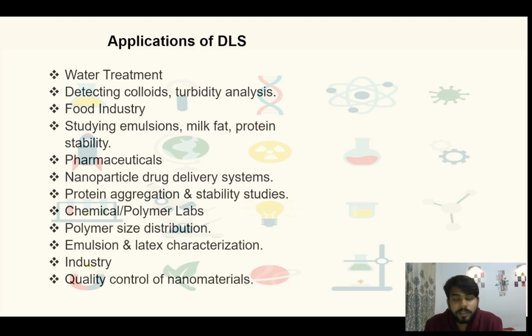And in polymer research, DLS helps scientists understand molecular weight, degree of polymerization, how the polymer behaves in different solvents, and how their behavior changes. This makes DLS extremely valuable in R&D and quality control.